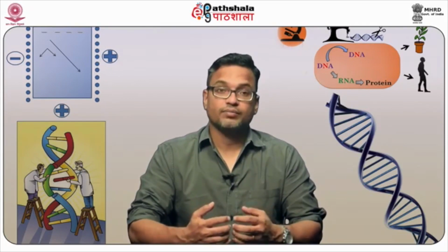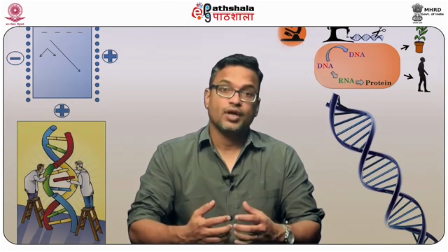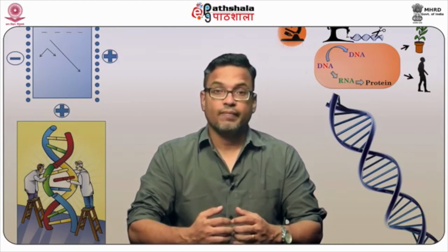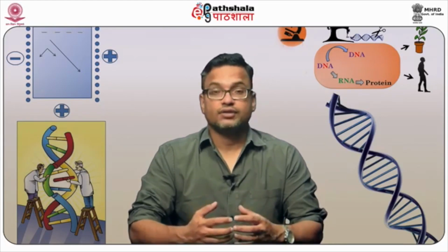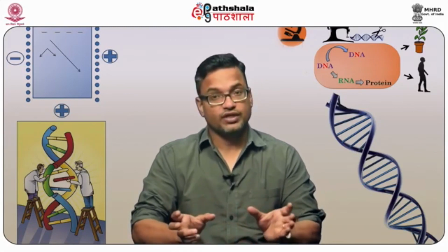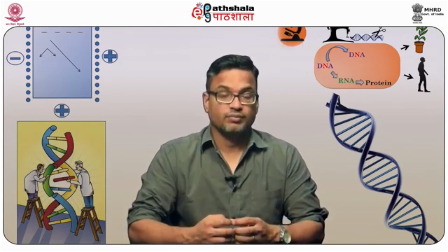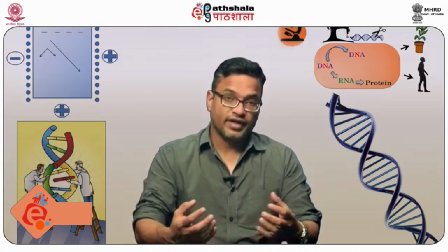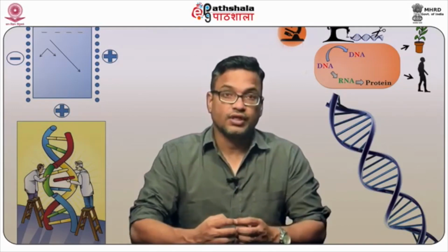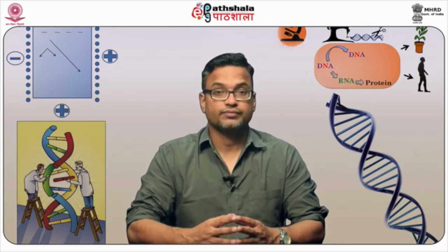very crucial technique which has been used to understand membrane dynamics, and which is based upon the evanescent wave system, and it allows researchers to better understand how protein interaction is happening on the membrane, as well as the overall structure of the membrane. So fluorescence microscopy has a range of applications and range of capabilities that allow researchers to address specific biological questions.